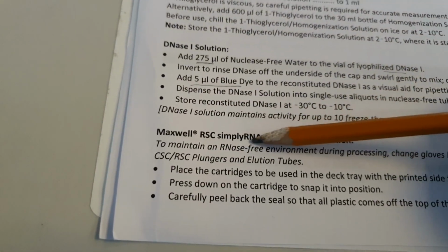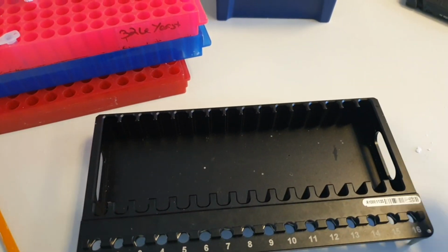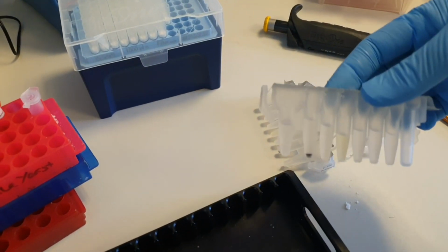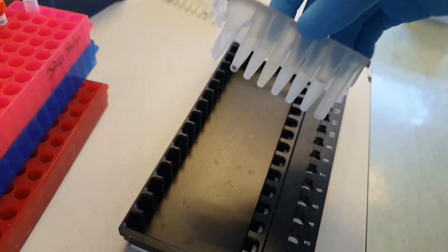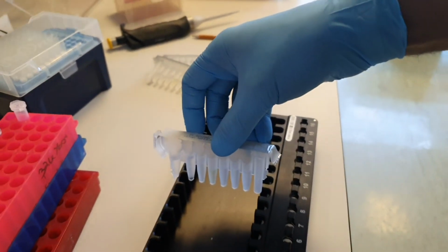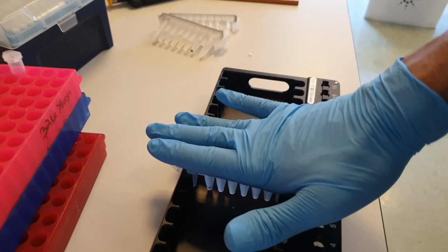Okay, so the next step is cartridge preparation. So let's see how to prepare the cartridge. This is the rack where the cartridges will go. So these are the cartridges. I have 3 samples, so I'm going to use 3 cartridges. It's important to place the cartridge in the right orientation. We have a big tube on this side that will go on the top, like that. So I will put this here and then push it down.